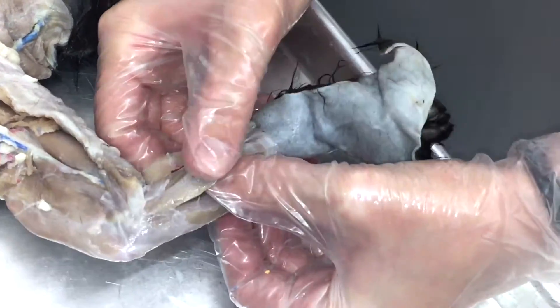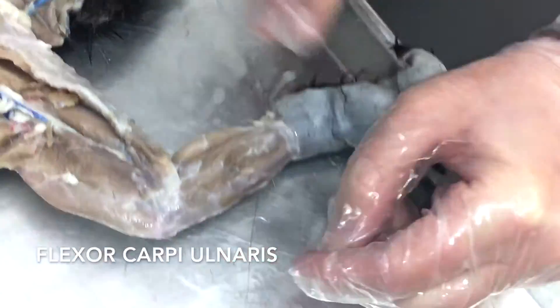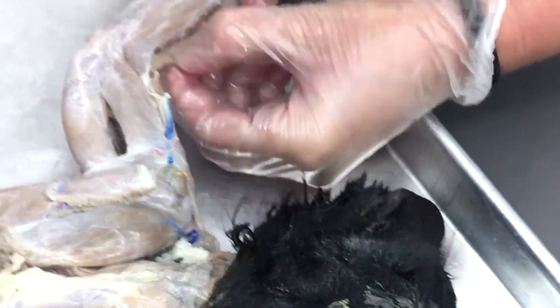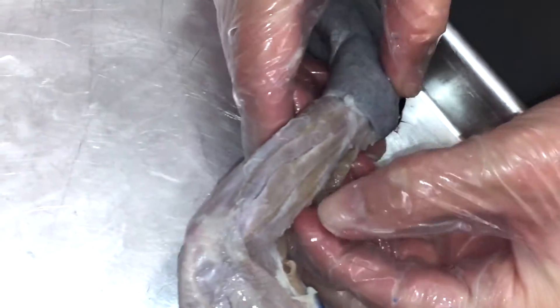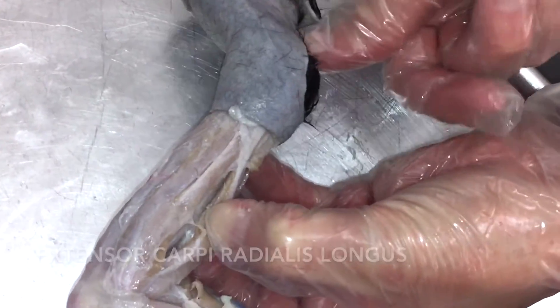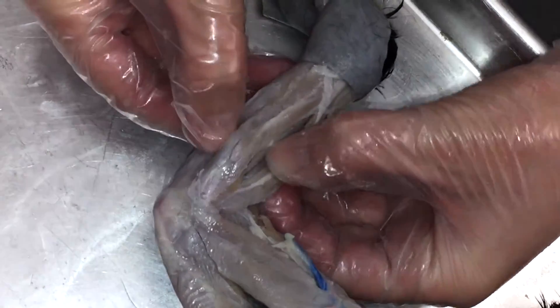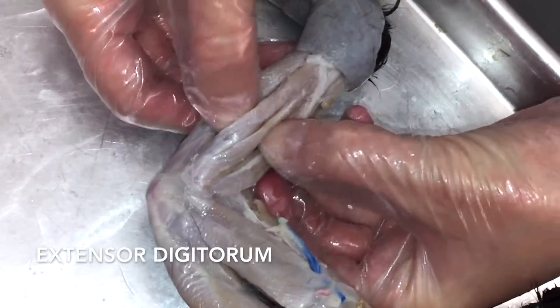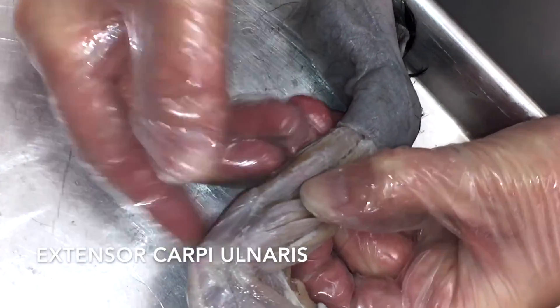Again, we have the brachioradialis and the palmaris longus. This guy over here is going to be your flexor carpi ulnaris. Flip it over — we can still see the brachioradialis muscle here, so don't get confused just because you can see it from both sides. The chunk of muscle next to it going to the thumb side is going to be extensor carpi radialis. There are two extensor digitorums on the back side, not just one like there is on the front side. And then there's an extensor carpi ulnaris.